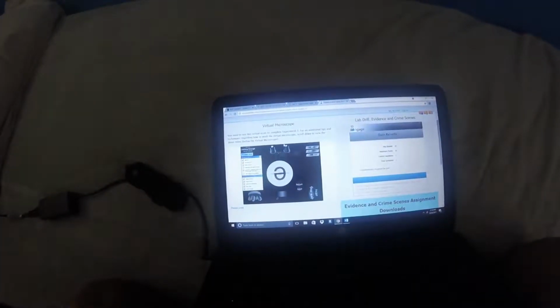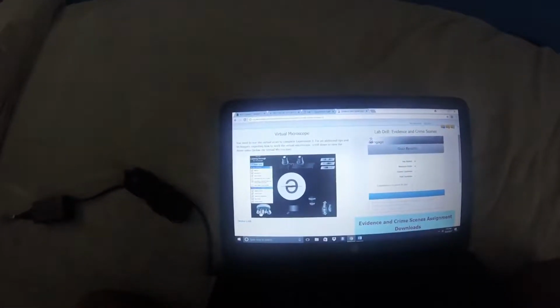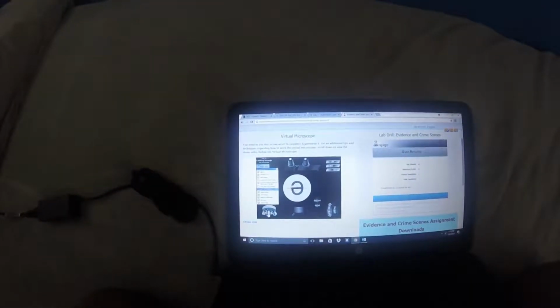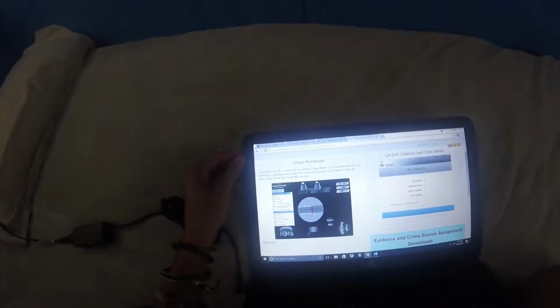Repeat steps 10 and 11 until the E no longer fits in the view field. Observe at what magnification this occurs. So right now it's on 10. Let's switch it to 40. Okay, so I can't see it anymore. It's just a blob. Well, just some lines right there.